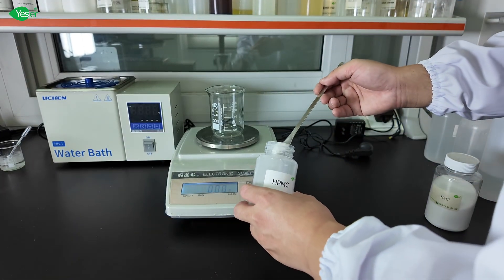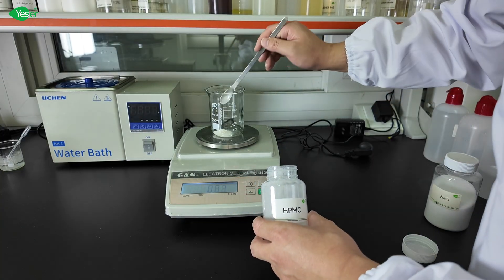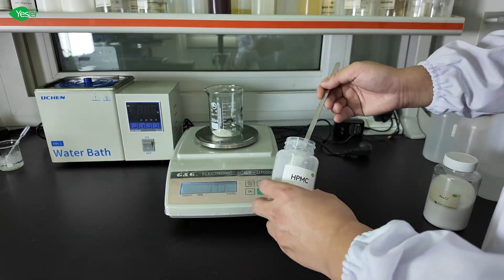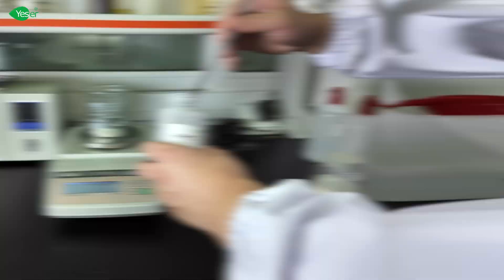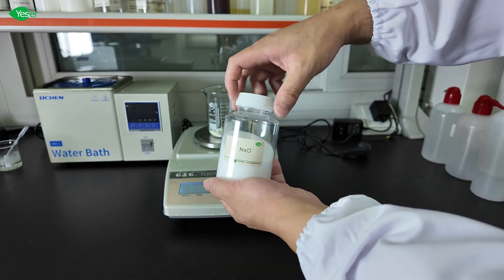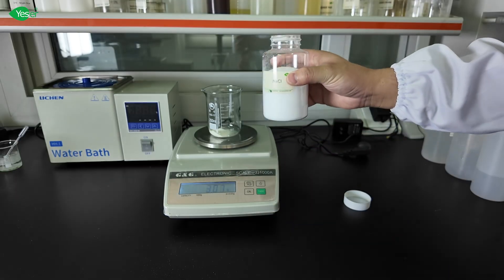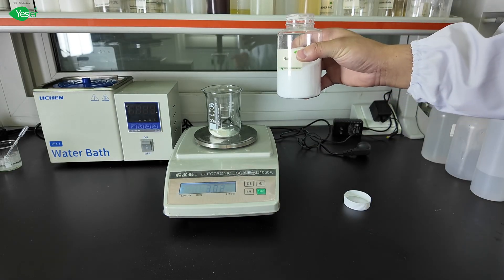Now let's add 3 grams of HPMC into this beaker. Now let's add the salt to the beaker. Make sure the HPMC to salt ratio remains the same as in your actual formula.